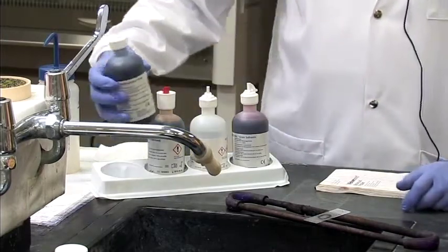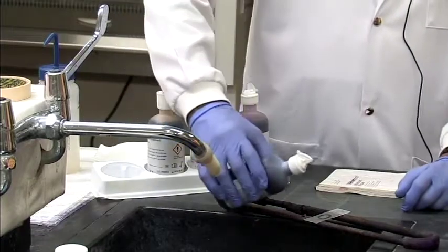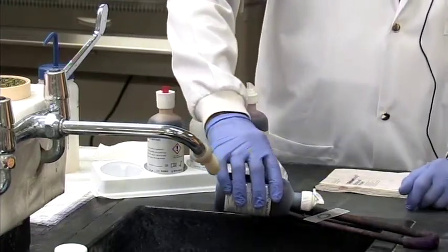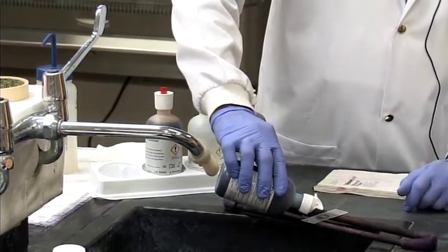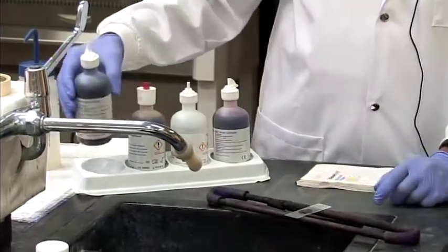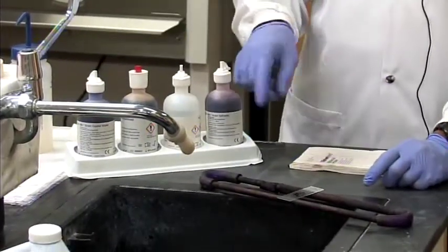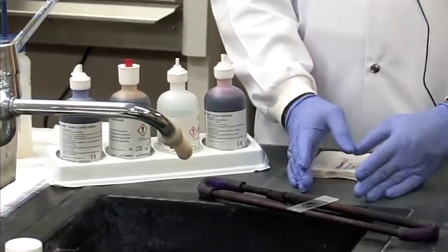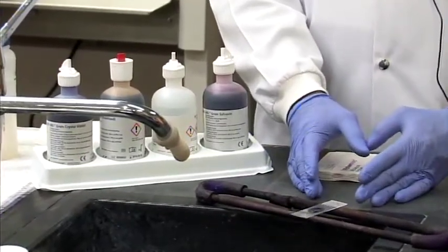So I'm going to apply a drop or 2 of crystal violet. Make sure the bottle is open. You don't have to squeeze, just invert, and a drop or 2 will come out from the spout, and it will fill that ring circle. And that's the purpose of making that ring in the beginning when we're making our smear. So it contains the stain. So now this has to sit and react for 1 minute.